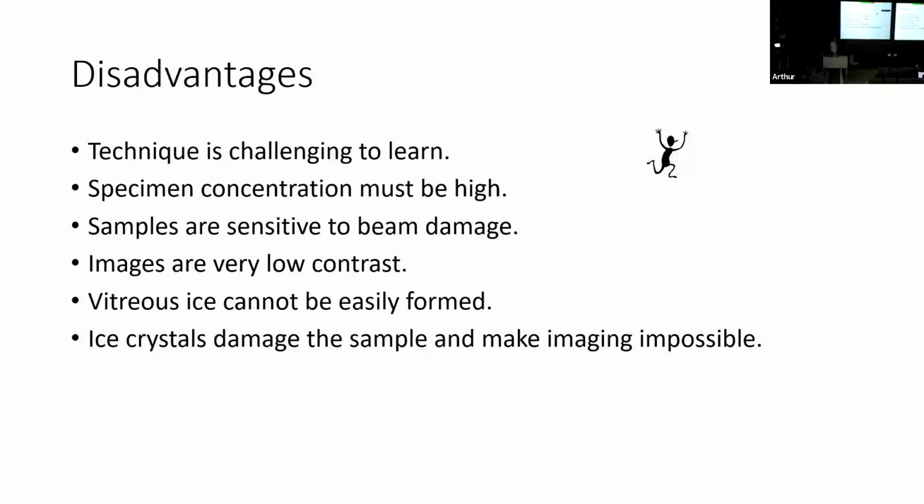Disadvantages of cryo-TEM. Well, one thing I didn't put on here, the microscopes are very expensive, so that's probably barrier number one. But it's a challenging technique to learn. It takes time and patience. And if you've never done any EM before, just be aware it's going to take some time and some practice. All right.